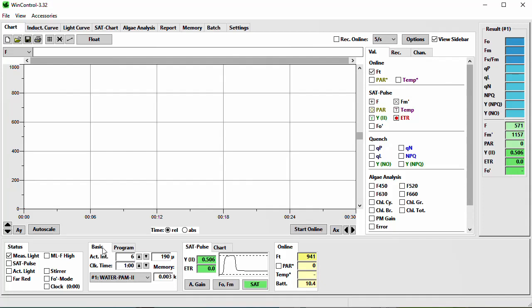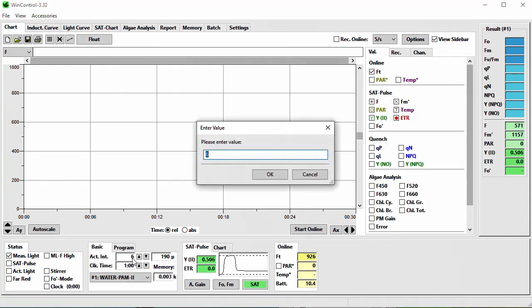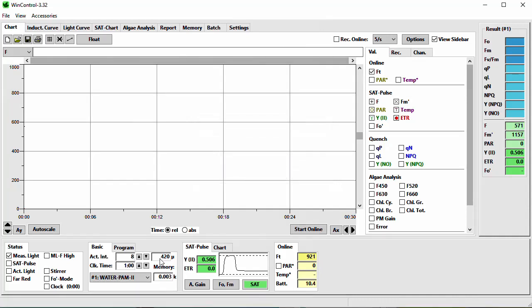The next field is the Basic and Program field. In Basic you can do minor adjustments without switching to the Settings tab — you can adjust the Light Intensity step of the Actinic Illumination and the Clock Time, using the arrows or by double-clicking into the field to type your changes. One field gives information about the applied PAR in the chosen Actinic Light Illumination Intensity. Another field shows the number of stored datasets, and another lets you switch between instruments when you have more than one connected to WinControl 3.